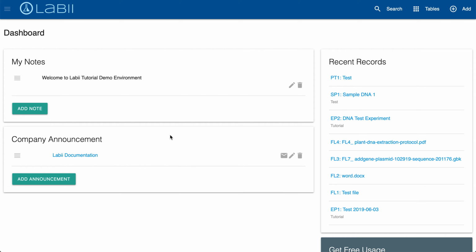A filter is a function similar to advanced search in regards to building a query when creating a new filter. However, filter takes us to another step as you can save search queries for later use. To start, let me demonstrate how easy it is to create a new record filter.